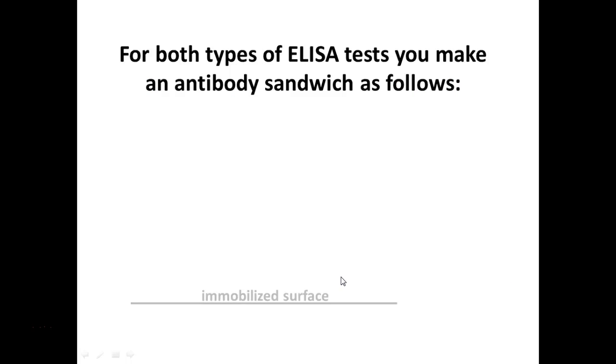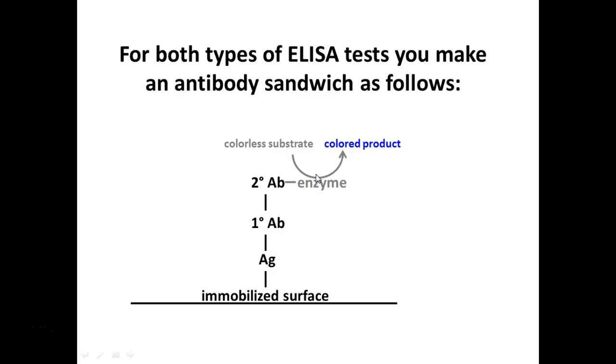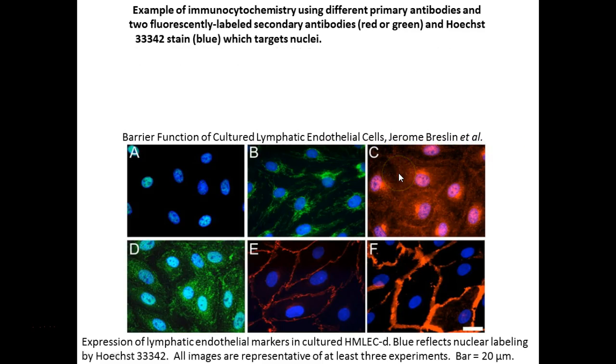So I'm not going to talk about HIV. I'm going to skip over that. So this is just a diagram, just like the animation. It's going to be antigen. We're going to stick to the surface. Then the secondary antibody. First antibody, primary, secondary, which has the enzyme. Add the substrate. We get the color change. Other ones will use things that produce fluorescent products, or even chemiluminescent products. There are different types of enzymes they can attach. In the case of ours, it's just a pretty color product.